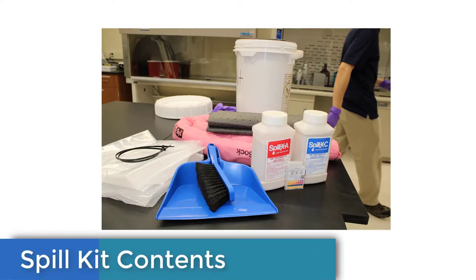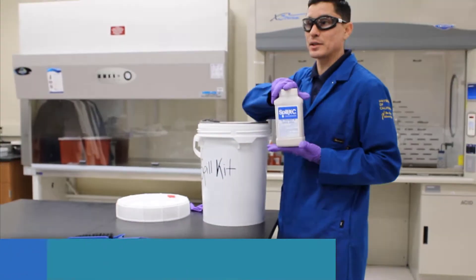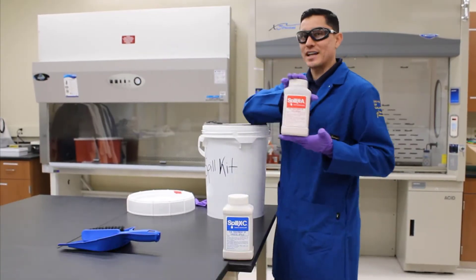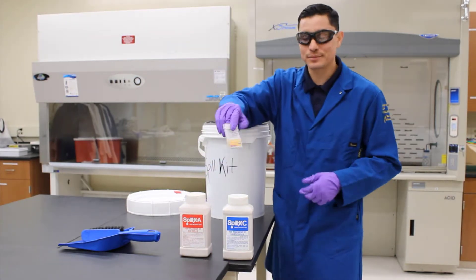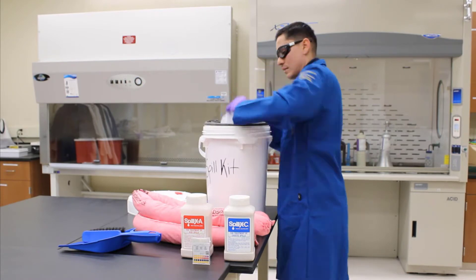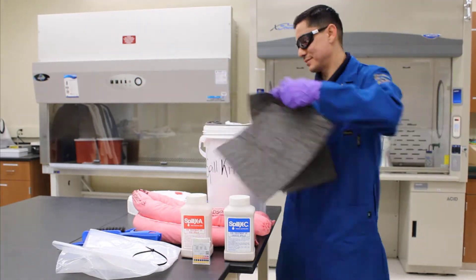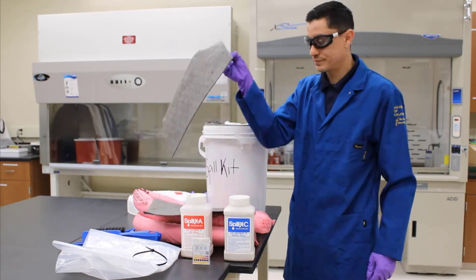Your area should have a spill kit. Each spill kit should include a brush and dustpan, base neutralizer, acid neutralizer, pH paper, spill socks, plastic bag, zip ties, spill pads, and tongs. Call EH&S if you have any questions.